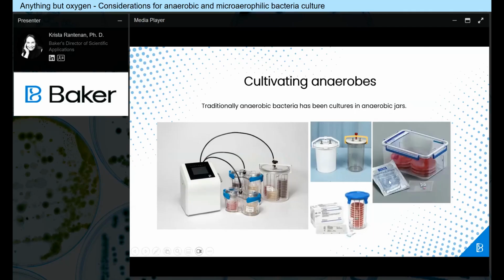So bringing in certain gases that, as a result of a chemical reaction, will eat away the oxygen from the environment and usually results in humidity. The gas packs or the gas replacement method usually include a hydrogen source, and the hydrogen and oxygen are then forming H2O in a simple reaction.